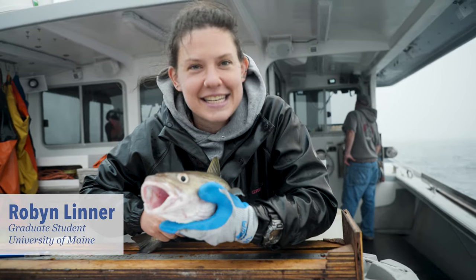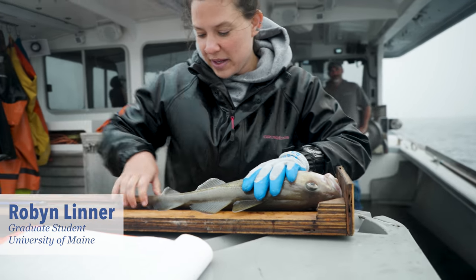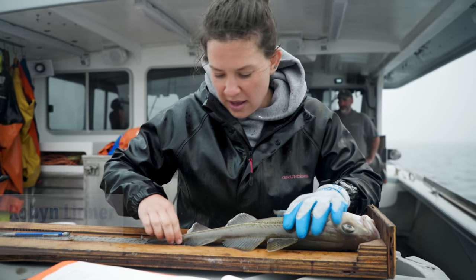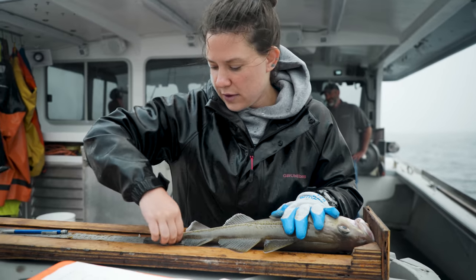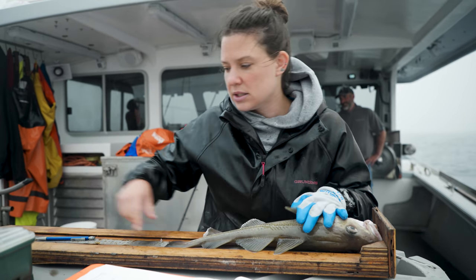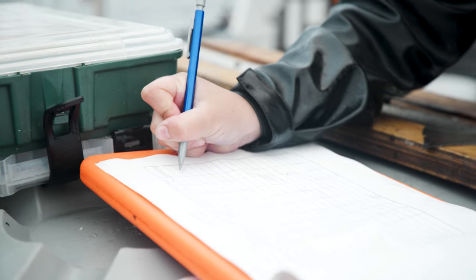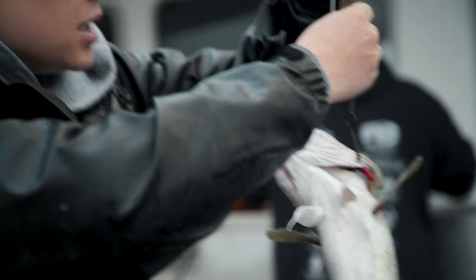This is an Atlantic cod and I take a whole bunch of measurement samples from this one since this is one of our target fish on the Sentinel survey. First we're gonna measure it — this one is 46 centimeters — put that right down on my data sheet, weigh it, and this one is two pounds.